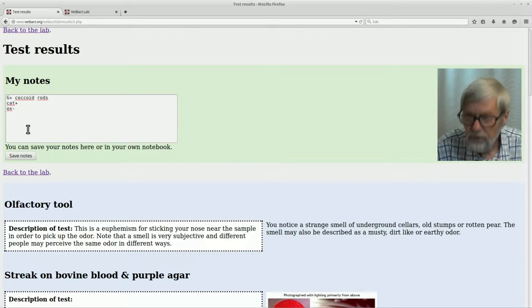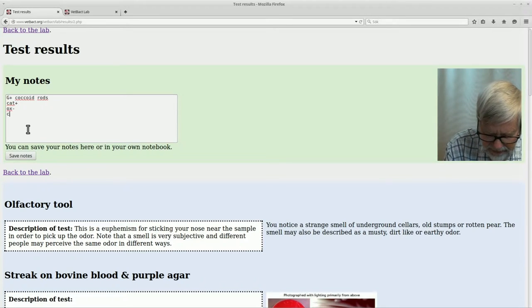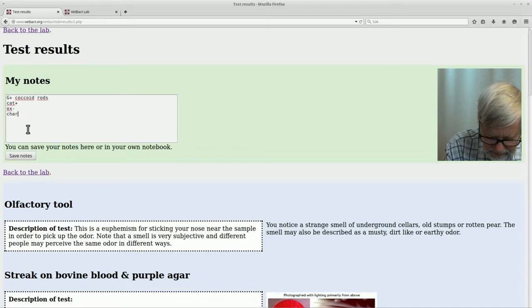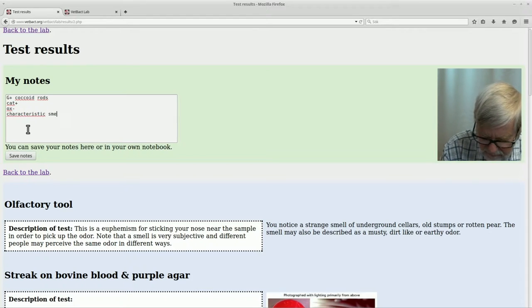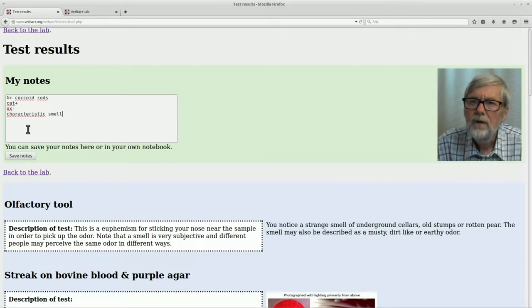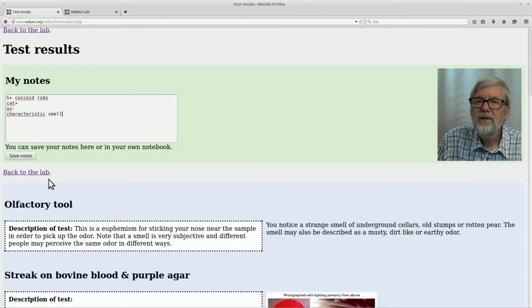So then you can summarize your results by filling in your notebook. It was gram positive and coccoid rods, catalase positive and oxidase negative. And we should also remember the characteristic smell. Then we can save the notes.